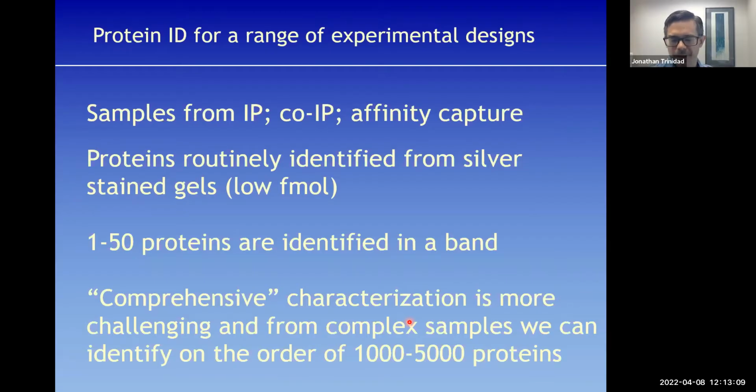And these things can come from a range of samples. We're somewhat moving away from gel bands here at IUB. I mean, if it makes sense from your biological sample prep to do an SDS-PAGE gel, then by all means, you do one, but we tend to do more in-solution digests.